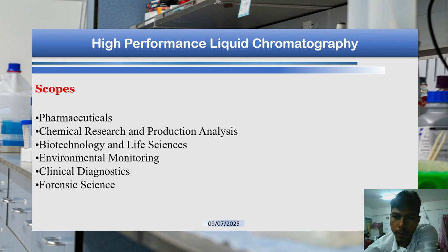This analytical technique is used in many sectors where precise separation and quantification are required, like pharmaceuticals, to assess drug purity and quality control; analyzing blood and plasma in biomedical engineering; analyzing fuel samples and raw materials in chemical and petrochemical sectors; food contaminants, vitamins and toxins are measured in food and beverage industries; and water purification, environmental management and monitoring, and clinical diagnostics and forensic sciences.